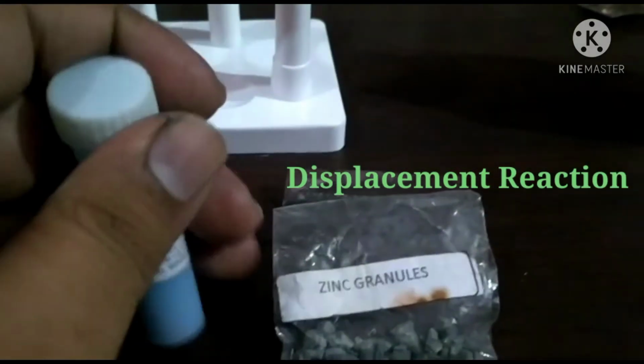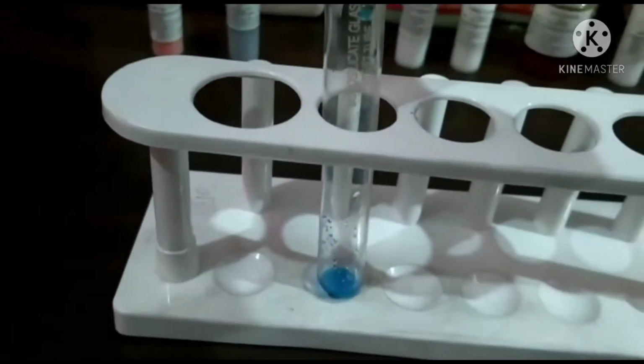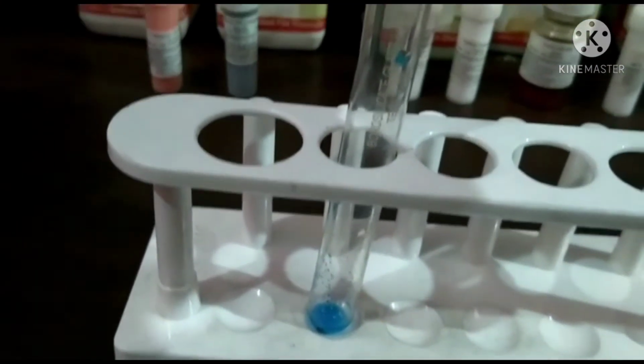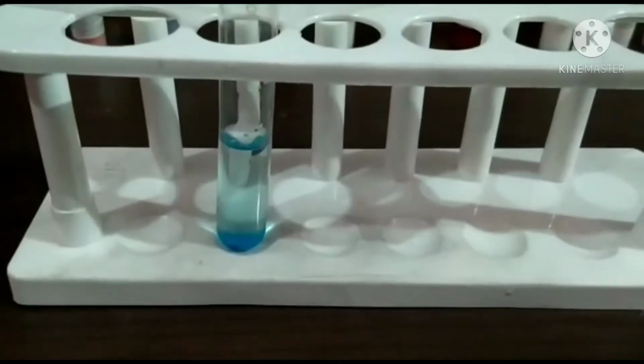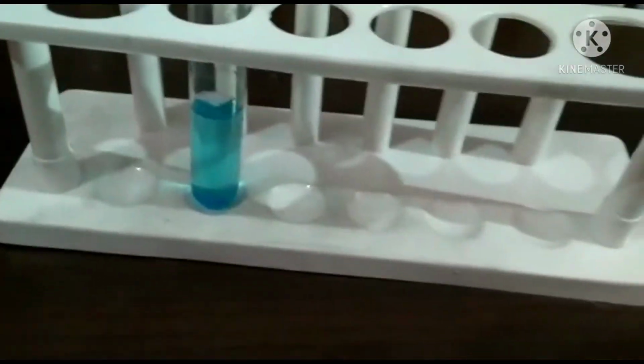The reaction between copper sulfate and zinc. Copper sulfate again is blue in color. We will add the copper sulfate to the test tube to make it a solution. Add water to it to make a homogeneous solution. We will mix it to make a homogeneous solution. This becomes a blue color copper sulfate solution. Now we will be adding zinc granules to it.